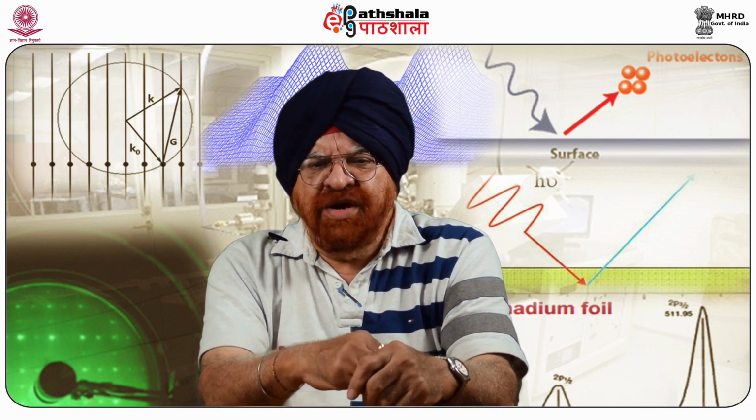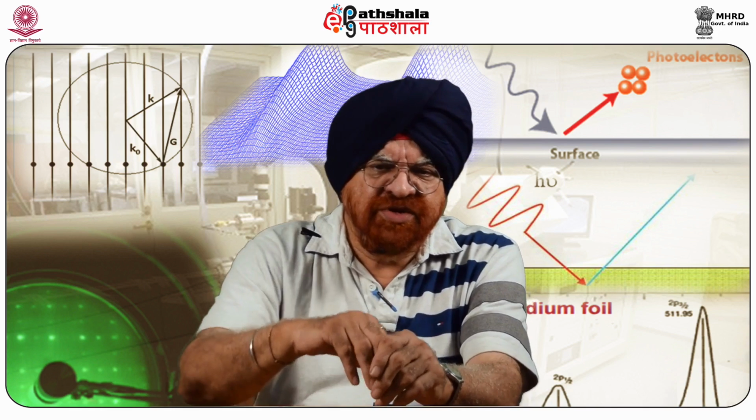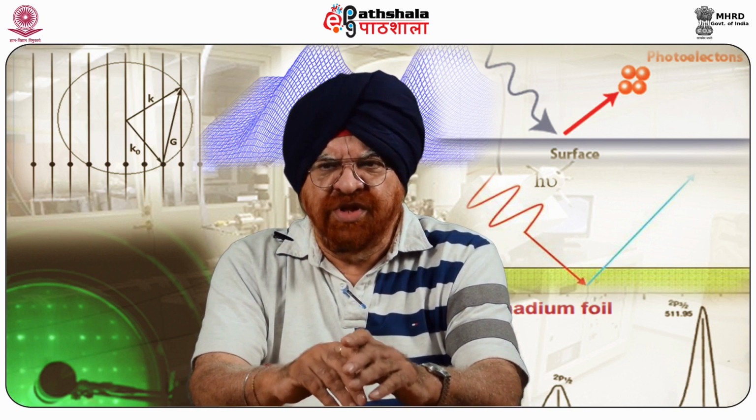Here, the binding energy of the core electron is characteristic of the individual atom to which it is bound. Information on the binding energies of electrons within a sample allows qualitative elemental analysis. For the peak to be resolved, the elemental concentration has to be greater than 0.1%.